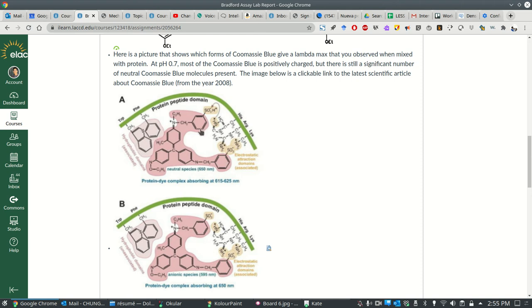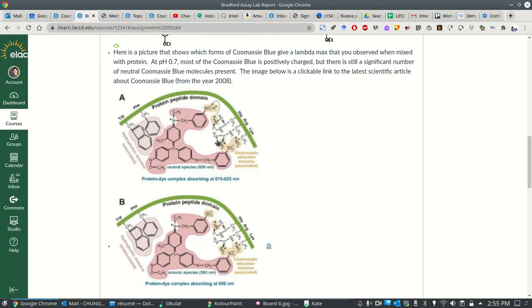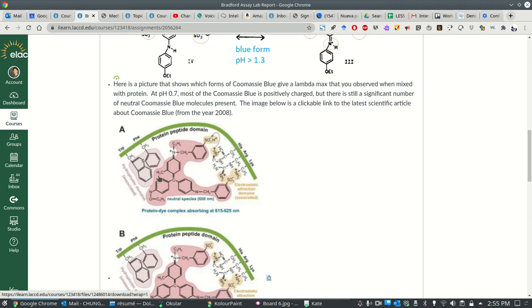So we want this to happen, and when this happens, you see, this molecule is no longer part of this equilibrium. So this is an equilibrium. You see, it goes forwards and backwards, just like you had some chemical reactions in Chem 65 or Chem 101 doing. They go forwards and backwards. Now, when this complex forms, you see this molecule, it used to be this molecule, it is not that molecule anymore. It is now in a complex.